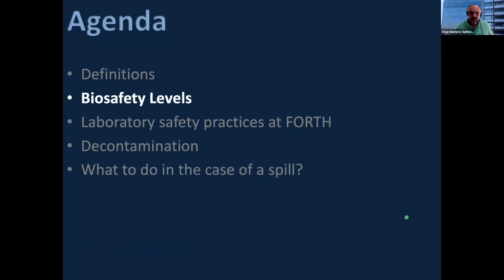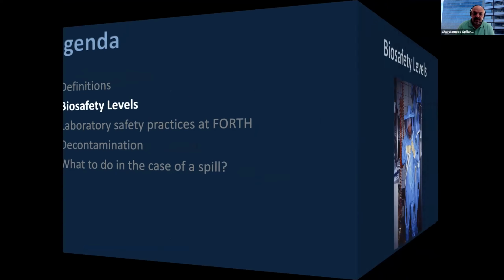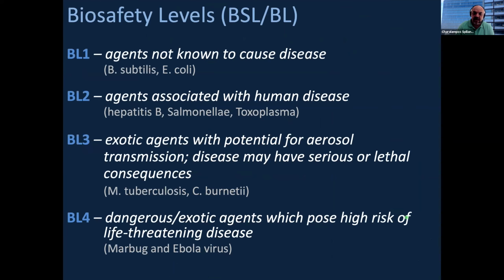Okay. Remember I talked about the different biosafety levels, and I said that all IMBB laboratories actually belong to biosafety level 2. So the designation either BL or BSL could be found outside the door of a lab. We don't actually have it here at the IMBB, but you could see such signs in certain laboratories designating the biosafety level and therefore the precautions that have to be taken before entering such a lab.